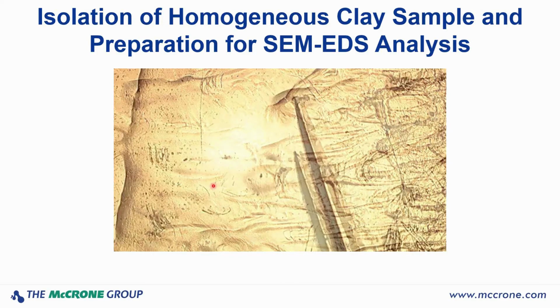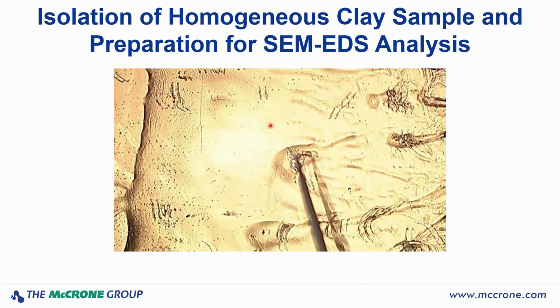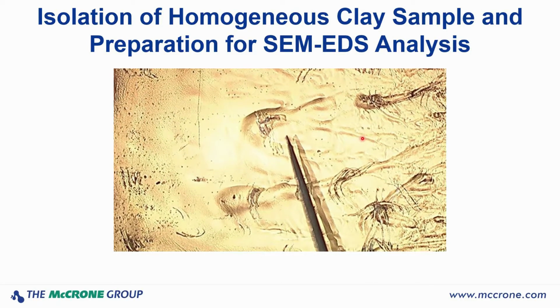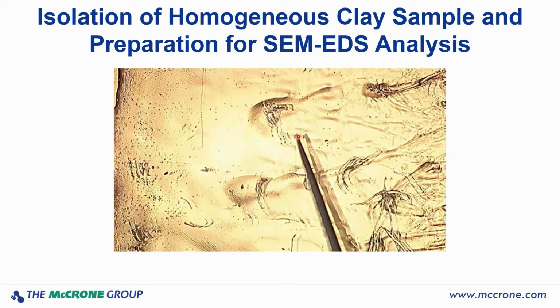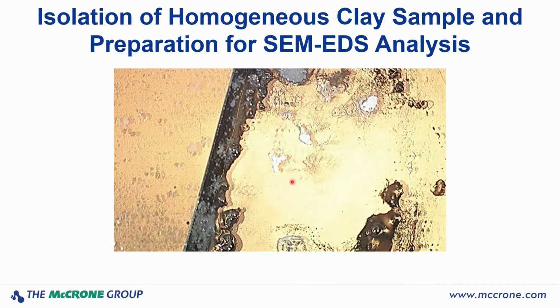Now, to mount that, to pick that particle up, I want to use a little bit of organic adhesive. So I've smeared some organic adhesive here on a glass microscope slide. You're looking at it with coaxial illumination. You would never see it with oblique illumination. I've put about a 20 micron particle of that adhesive on the tip of my needle.